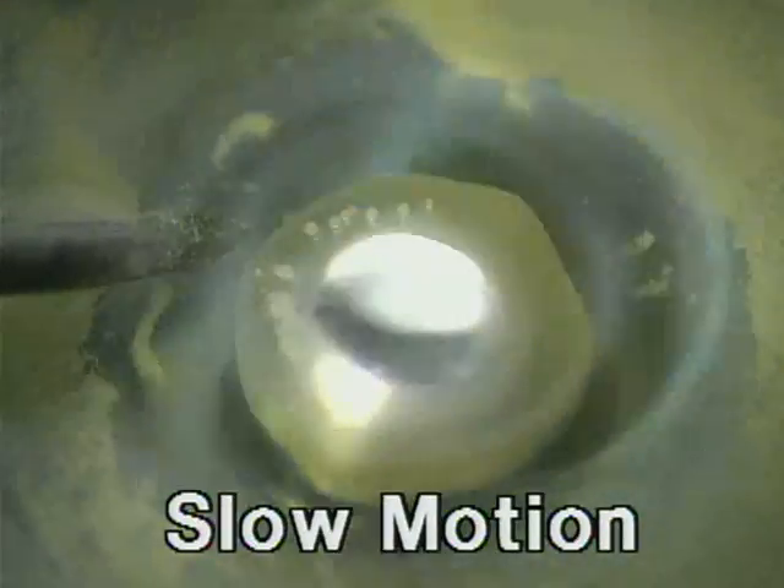Eventually, the mercury drop expands to touch the iron nail, at which time electrons flow from the nail to the mercury. The electrons reduce the mercury-1 ions to mercury, destroying the surface film.